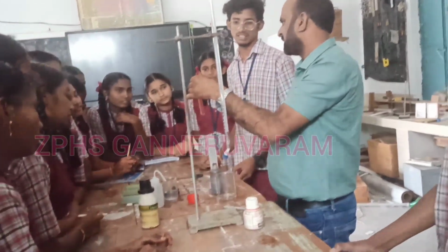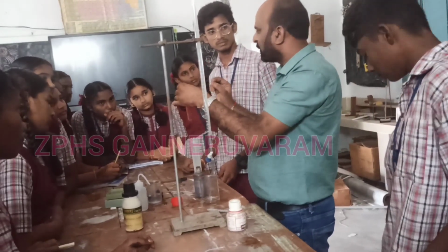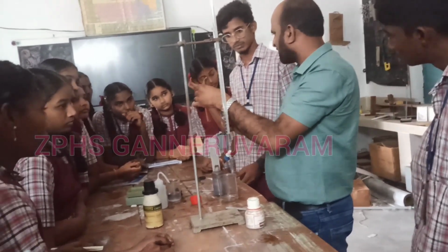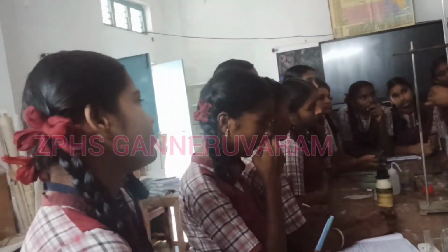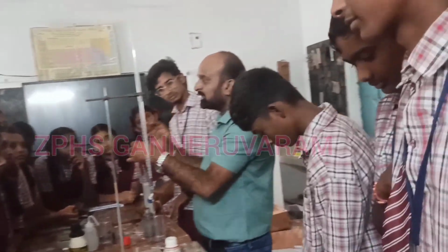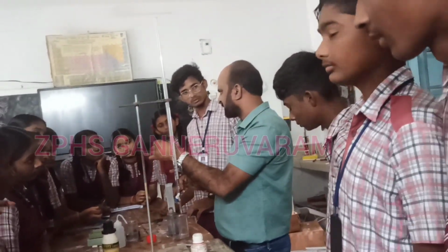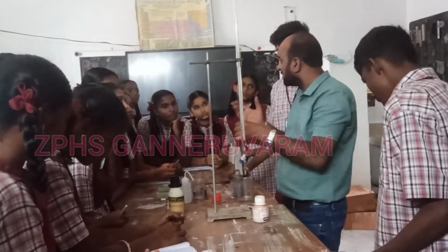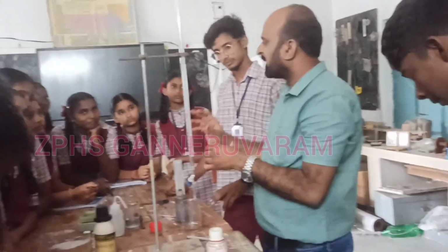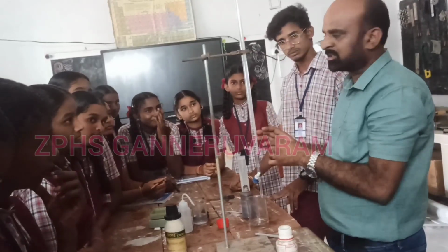If you take phenolphthalein and add it to the sodium hydroxide, it turns to pink color, and then when you add the HCl to the test tube, the color will disappear. The phenolphthalein is not available in this lab.